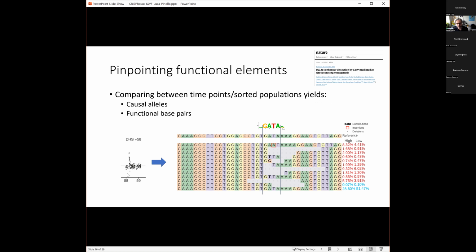So usually with count-based data, you get this kind of profile. There is some enrichment, so maybe this perturbation is effective. So you can take one perturbation and actually see what the alleles are. But now, what I showed you before was for one experiment.